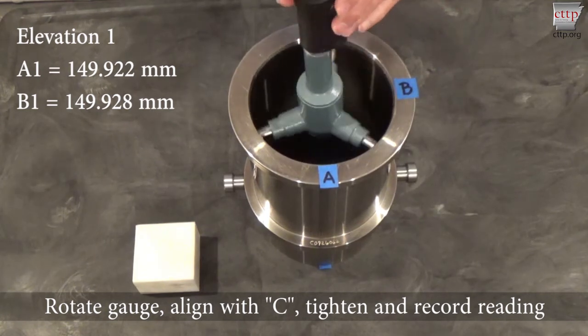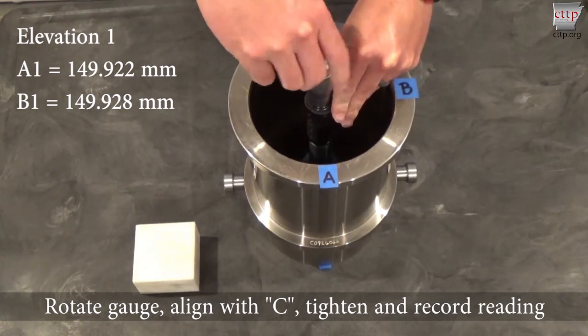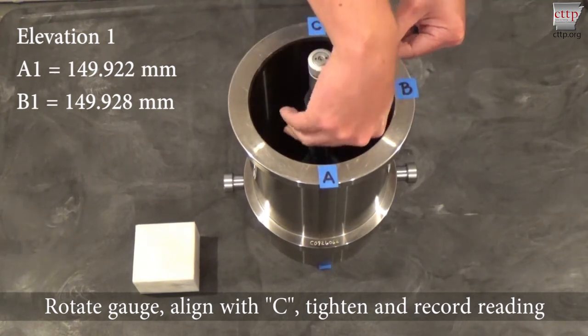Rotate the bore gauge and align the arm with position C. Tighten the bore gauge, record the reading, and then loosen and remove the bore gauge from the mold.